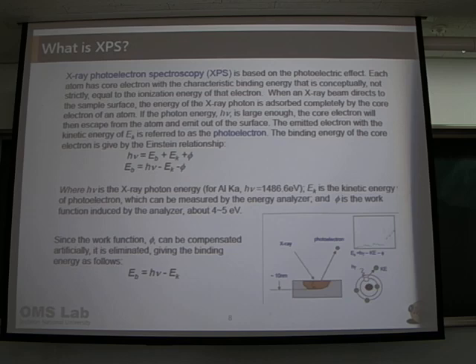Don't repeat, please. We heard that. So you're applying incident h nu, right? With that energy, your material, your atom, your compound is subjected to the incident energy with h nu, and what are you measuring? In this case, the detector can detect the kinetic energy. What kind of kinetic energy? The kinetic energy, okay, I will show later.